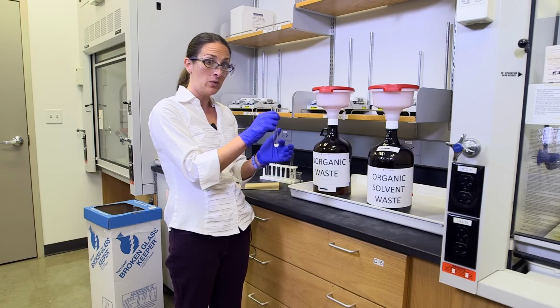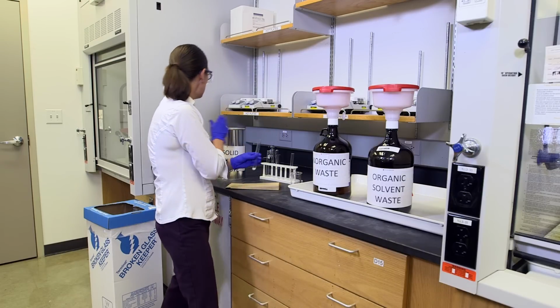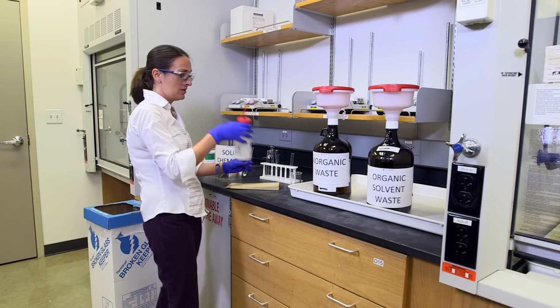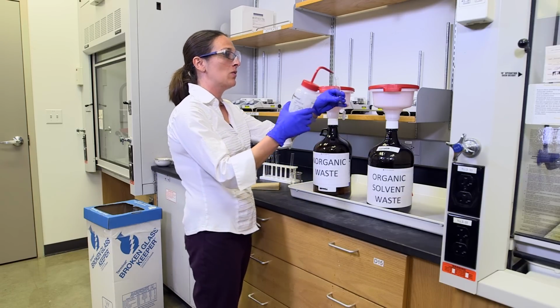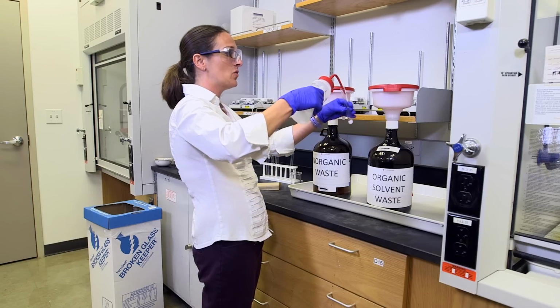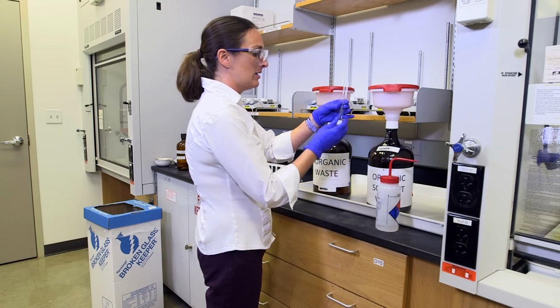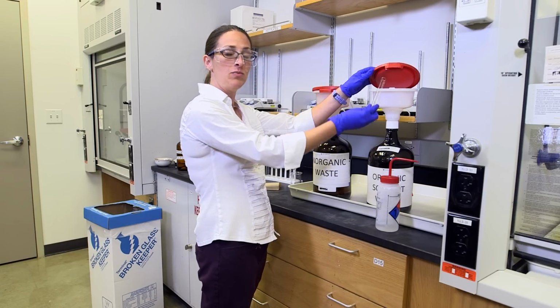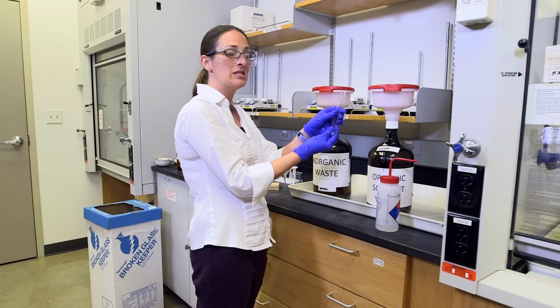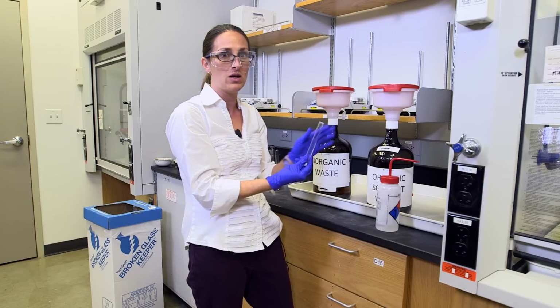Once it has become a liquid again, once it's melted, I will take my acetone squeeze bottle and squeeze my acetone in here, and I will rinse it out. I'm not going to pour that acetone that I used to rinse down the sink. I'm going to pour it into my organic waste.